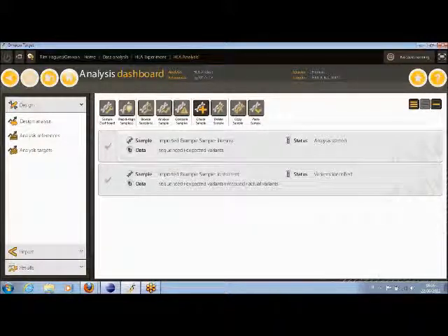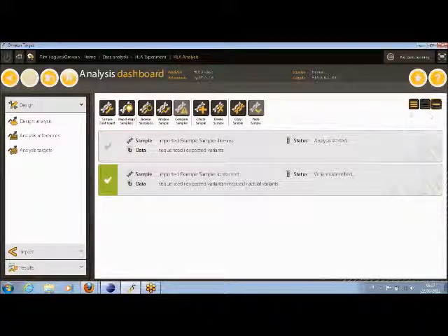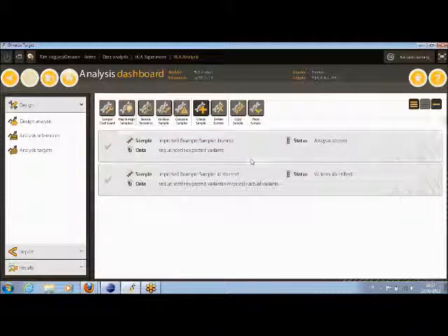If I select a different experiment, this one here, I'm just going to select an analysis. We've got a list of some items in here. On this side, we've got a few list handling facilities. You can select individual items in order to do things with them, or you can select them all with this function, deselect all, or you can swap the selection around by using this function here. So this is some of the list handling functions within the tool.